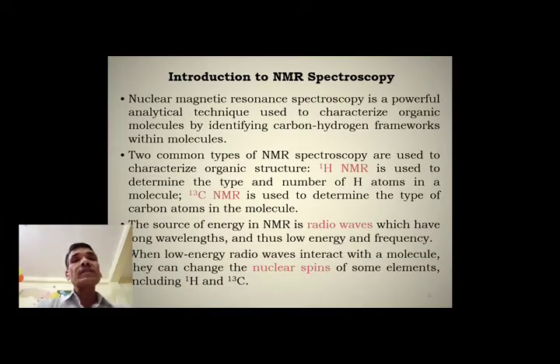While introducing NMR spectroscopy, nuclear magnetic resonance spectroscopy is a most recent and powerful analytical technique used to characterize organic molecules by identifying the carbon-hydrogen framework in a molecule.